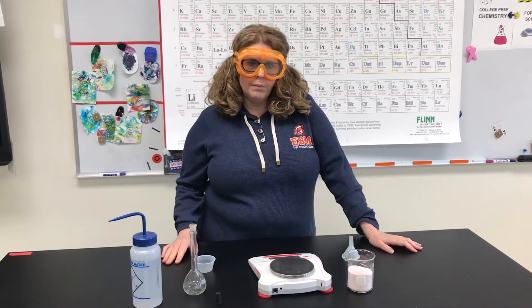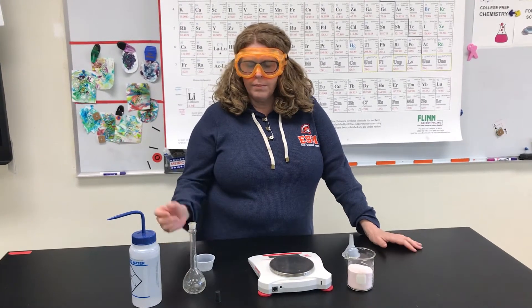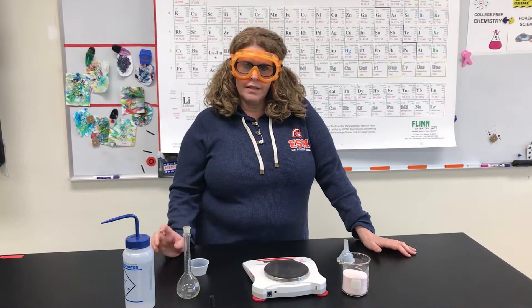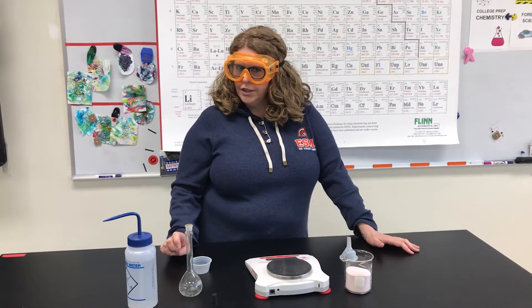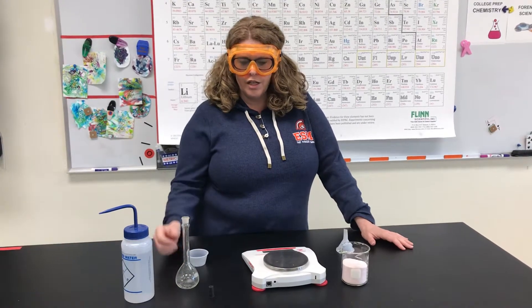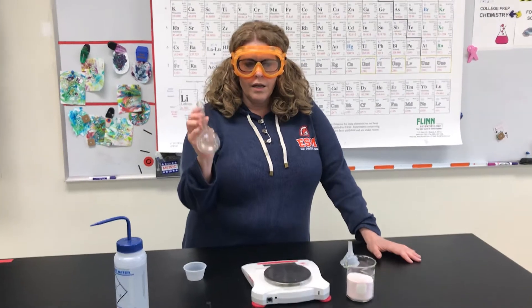Hi. Today we are going to be making our solution of Kool-Aid. It's going to be our first concentration. I'm forgetting what molar it is — is it 2 molar? I think so. So we're going to be making our 2 molar concentration. We're going to make 100 milliliters of 2 molar Kool-Aid.